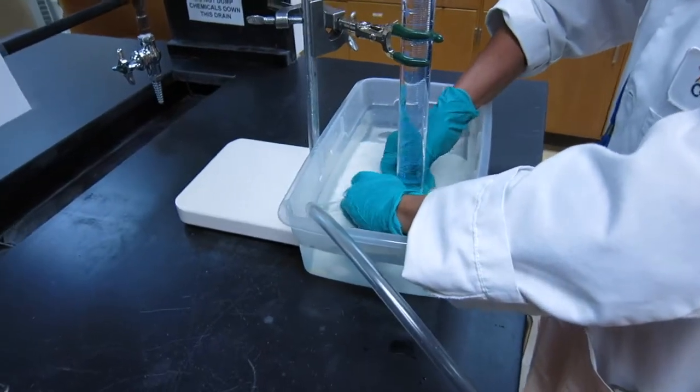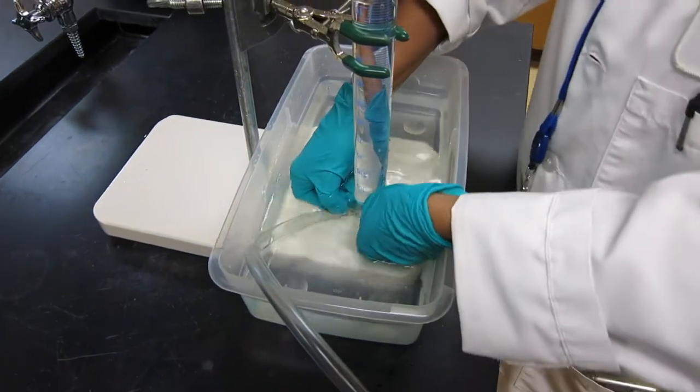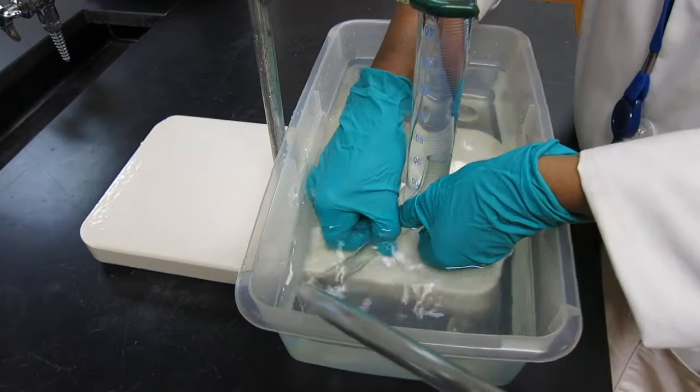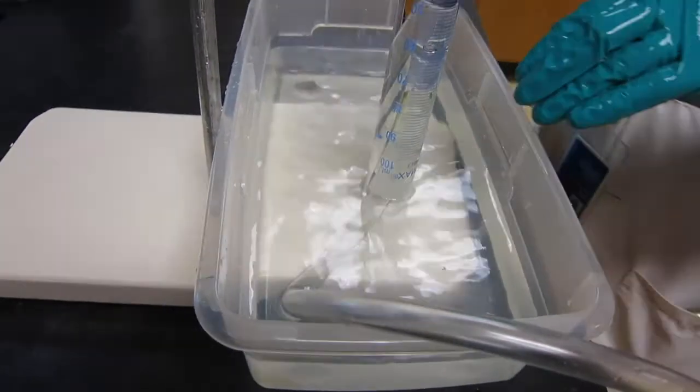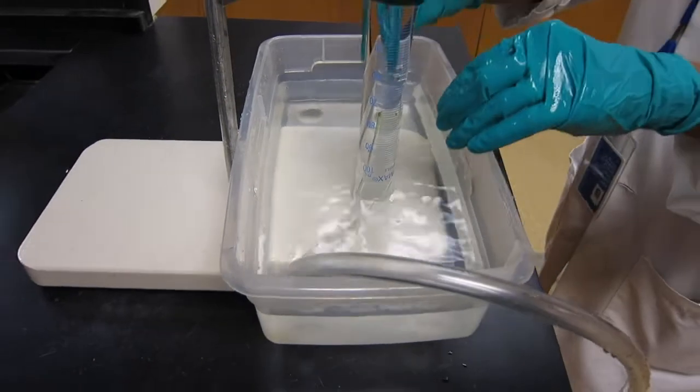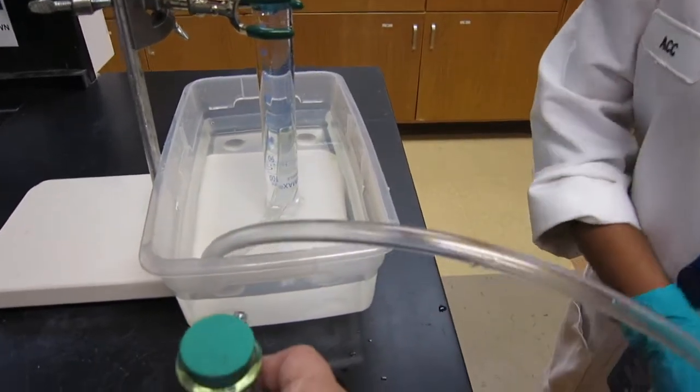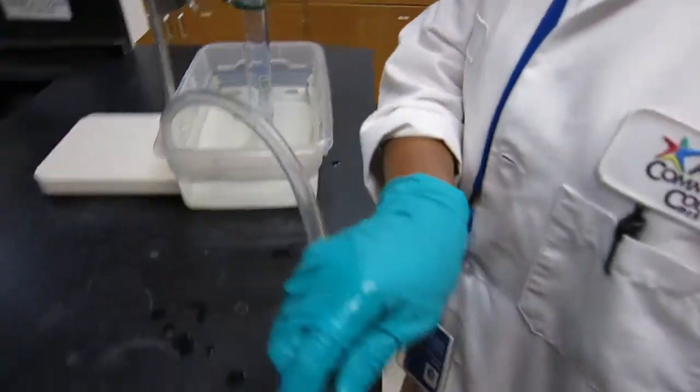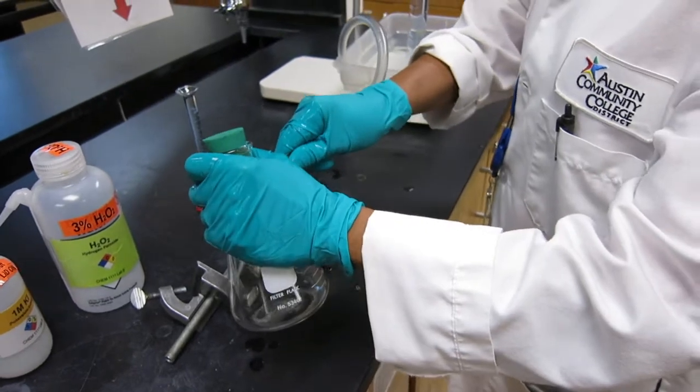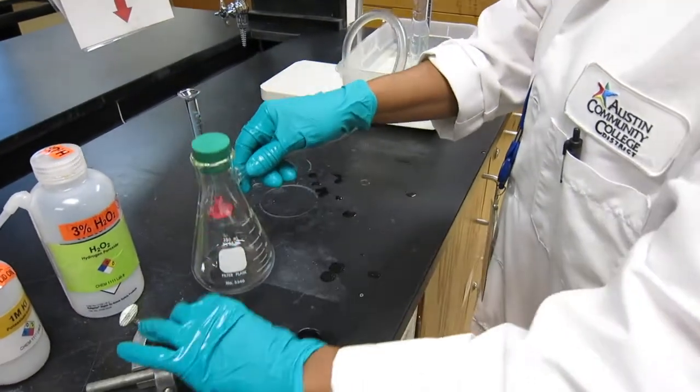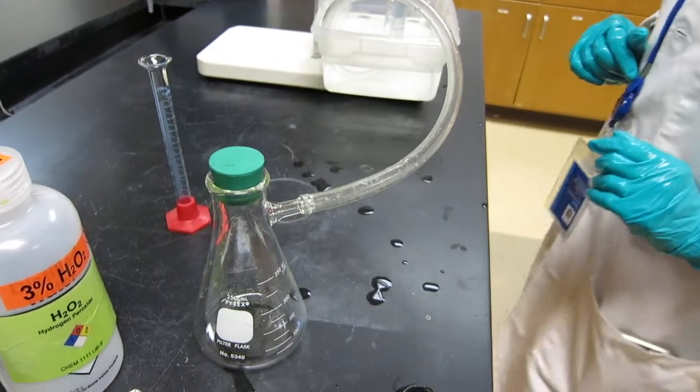Next we are going to place the tubing inside the graduated cylinder. And now we're going to connect it to the side arm flask. And we need to make sure that you put stopper on it.